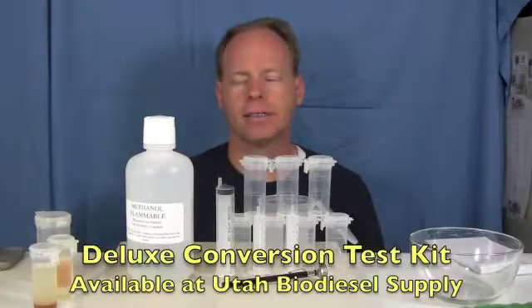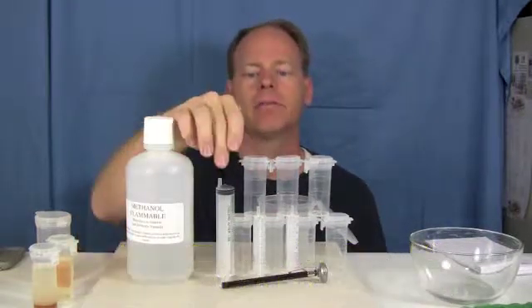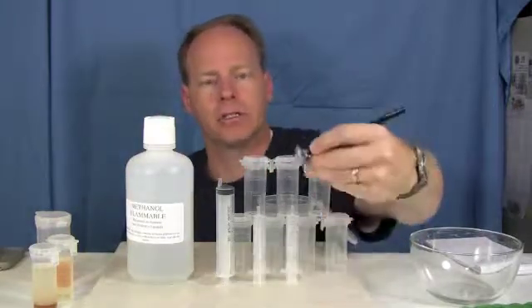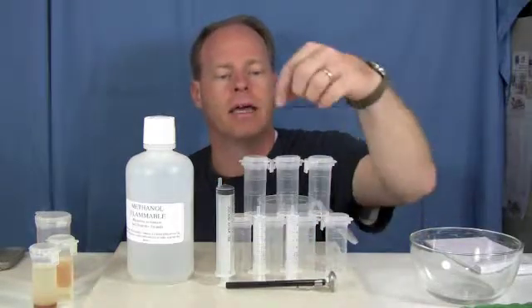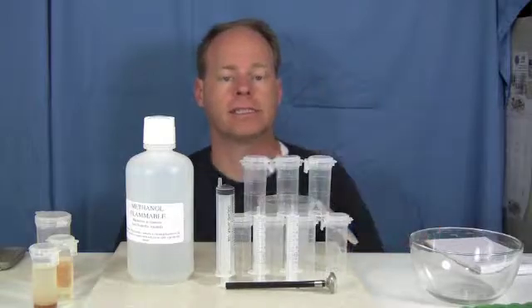So let's get started. Utah Biodiesel Supply sells a handy biodiesel conversion test called the deluxe conversion test kit. We have a bottle to put your methanol in, a 30 milliliter syringe, two 10 milliliter syringes, a temperature gauge to measure the temperature of your biodiesel and your methanol, and several vials to do this test in.